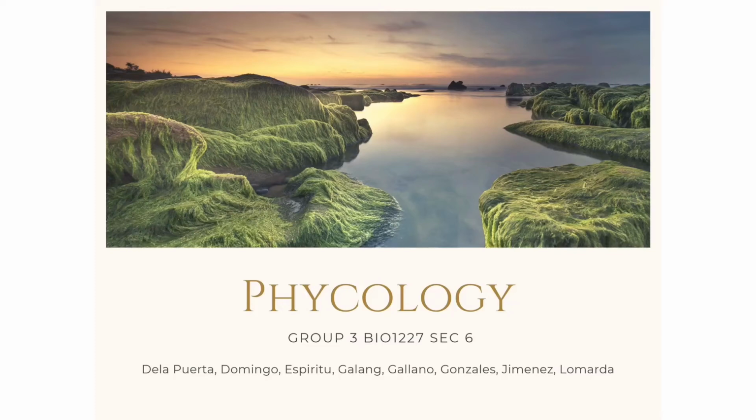Good day to all. We are Group 3 and we will be discussing Laboratory Exercise Number 3, Phycology: Morphology of Algae.